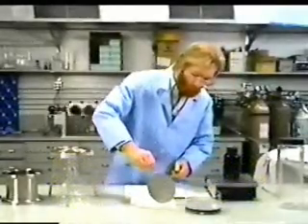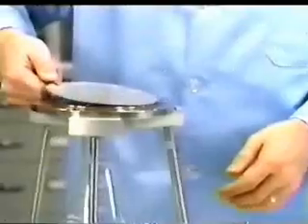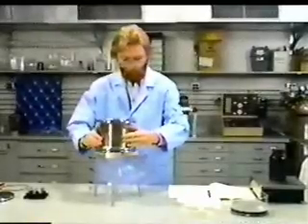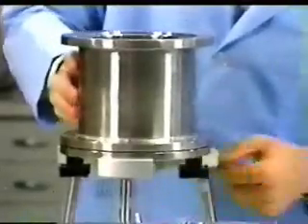Prior to use, the steel filters must be boiled in reagent water or otherwise de-aired and stored in reagent water until used. As with the glass fiber filter, the steel filter is mounted in the filtration device. However, because the steel filter is rigid, the support screen used for the glass fiber filter is not required.